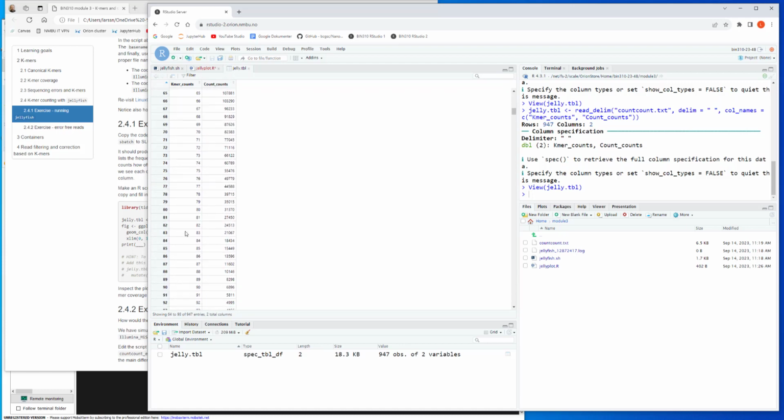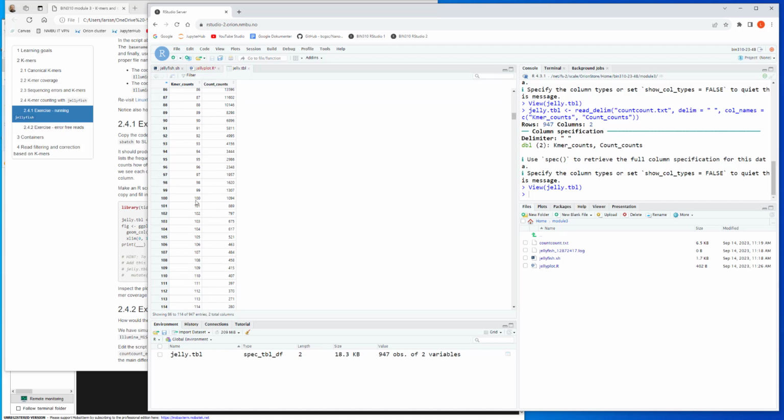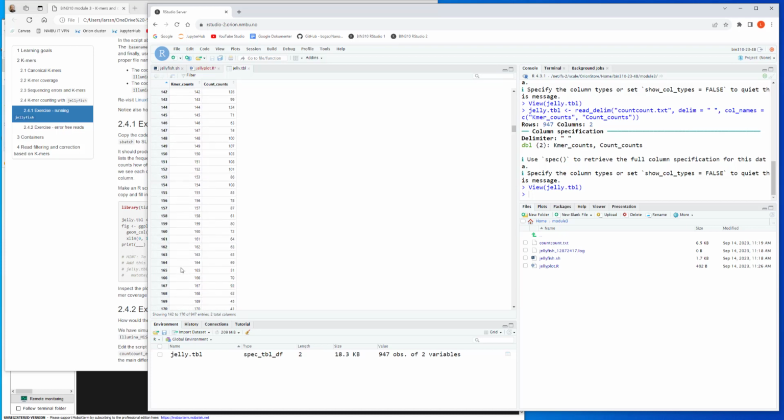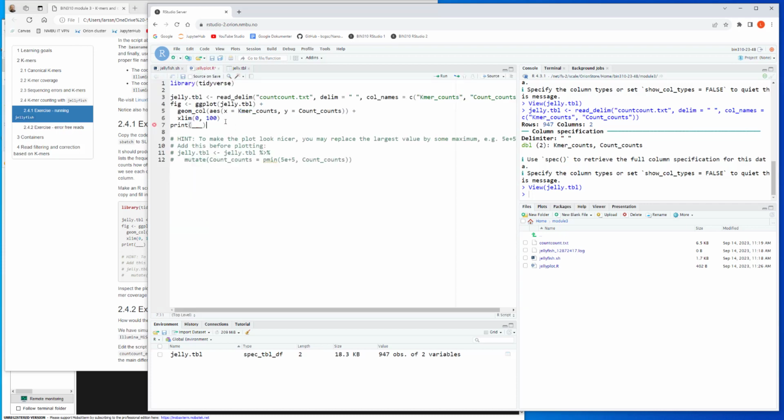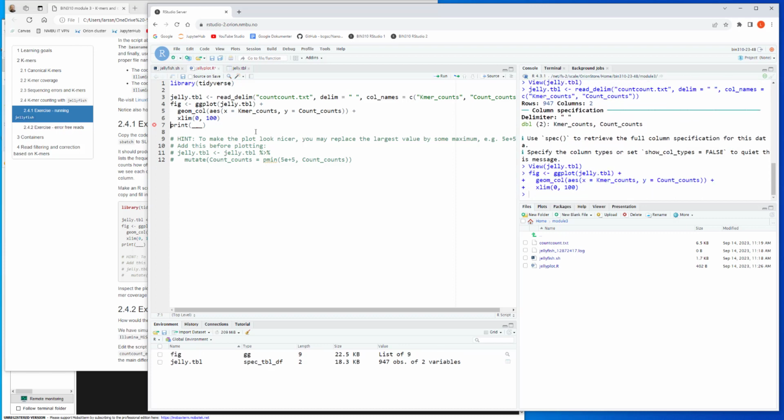If you scroll down, you can see here is 100, yeah, and there are some values which are super big here. If we scroll all the way down, yeah, 5,000, okay. Yeah, you can experiment by removing this and see what happens, but then the plot becomes very difficult. It's almost sort of empty.